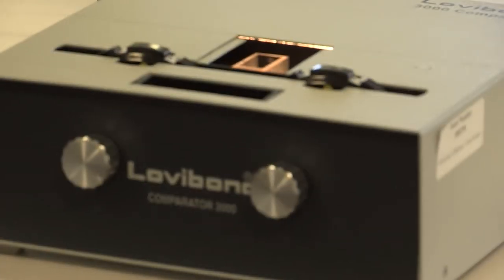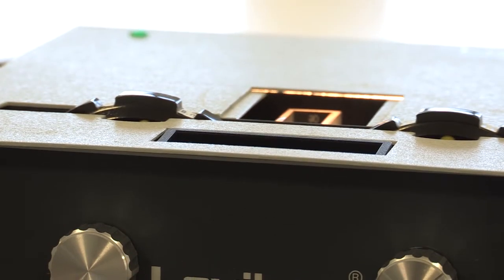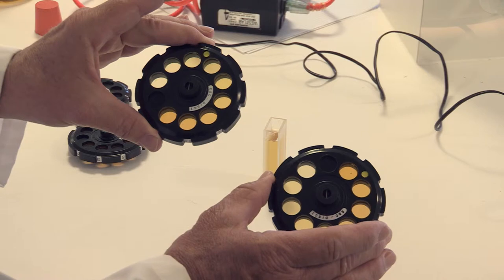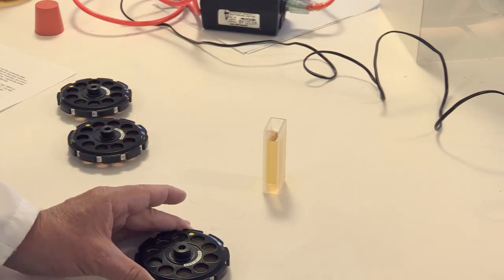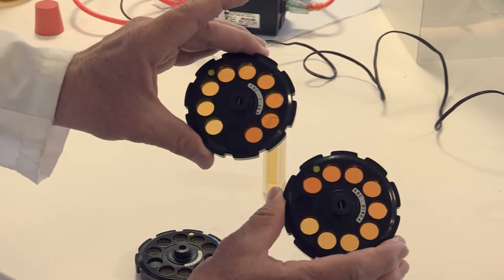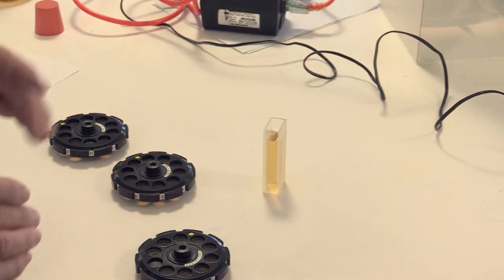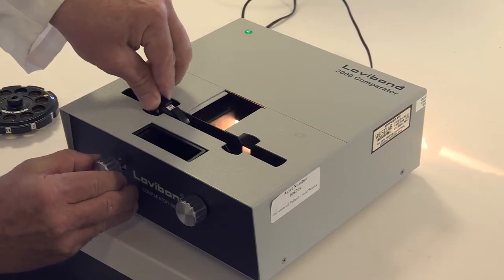The colour comparator has two discs, each containing a range of coloured glass standards. The aim is to match the colour of the sample with the colour of the glass standards. For EBC measurements they come with two pairs of discs. One pair covers the range of 2 to 10 EBC units in steps of 0.5 units, and the other pair is from 10 to 20 EBC units in steps of 1 unit.